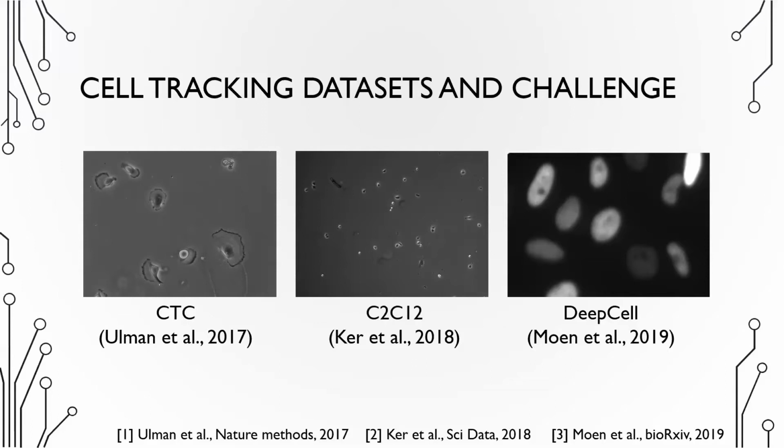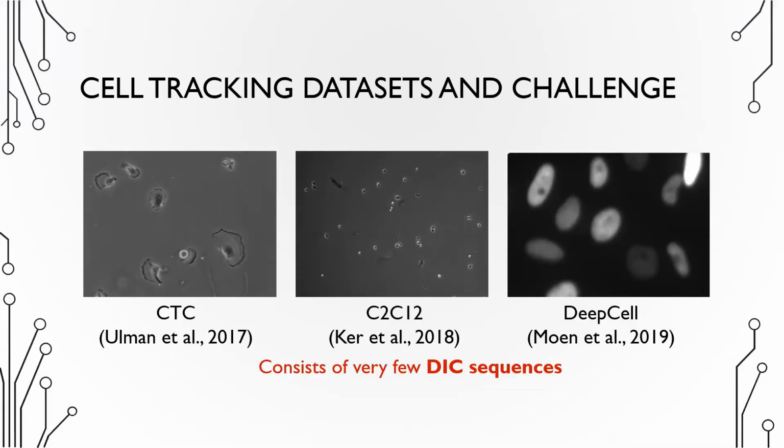For example, in terms of imaging modality, across the three datasets combined, there is good representation of phase contrast and fluorescence microscopy videos. However, we see there is a lack of sequences obtained using the DIC modality. In fact, only CTC offers 2 or 4 DIC sequences.